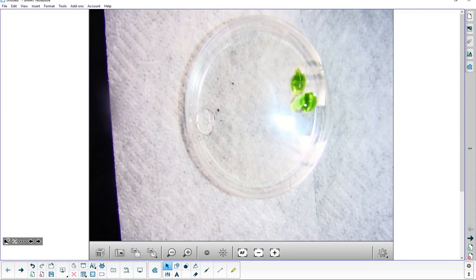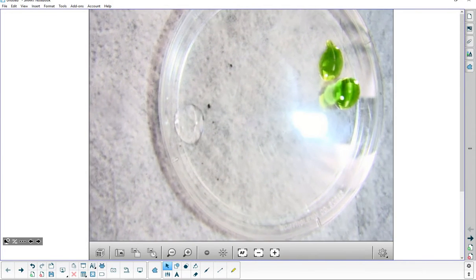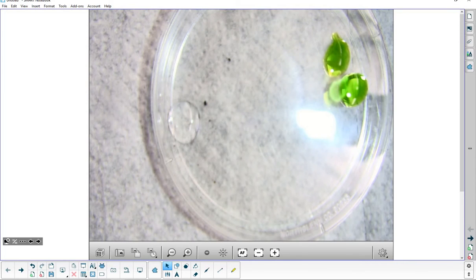Okay, so I'm going to zoom in just a little bit so we can see those greens a little bit better. You've got to decide when you're calling it, because if you look right now, you can start seeing the outside going a little bit orangey yellow. Do I call it now, or do I wait until more of it's orangey yellow? Or do I wait until it's all orange or yellow? Or do I wait until it's all dark orange?